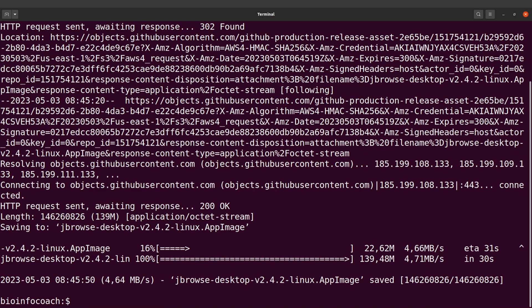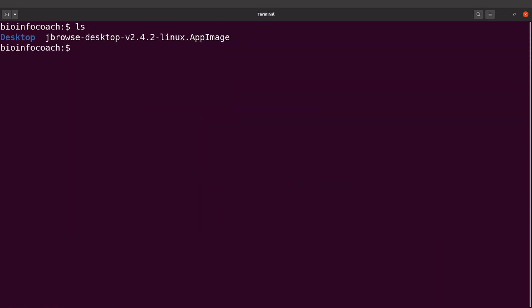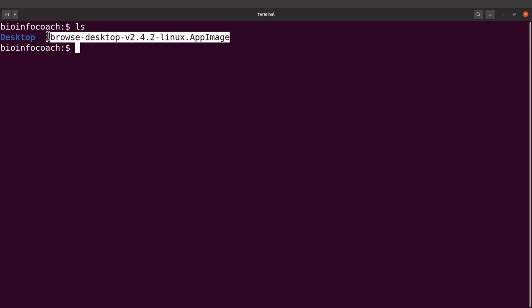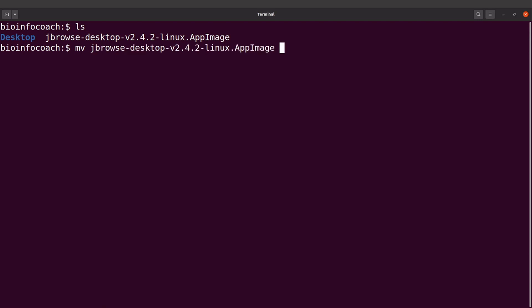The file has been downloaded. Let's clear the screen and do an ls — we can find the file here. The filename is very long, so I'm going to rename it. I'll say mv and specify the name, then rename it to jbrowse to use a shorter name.